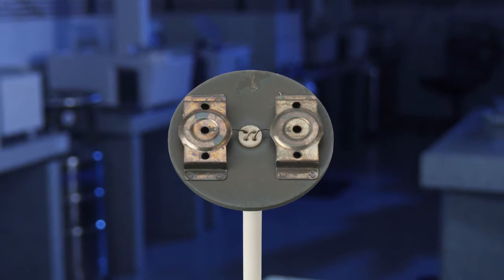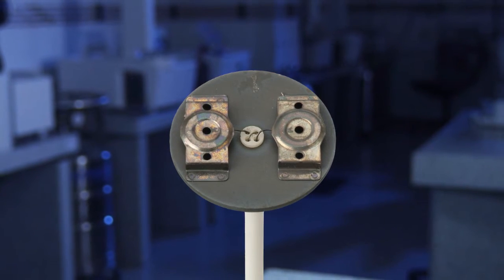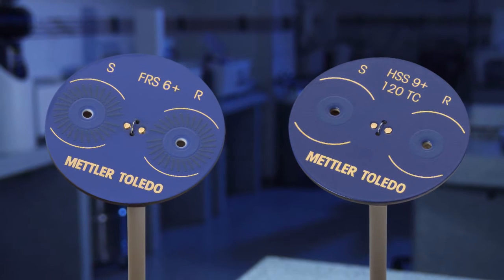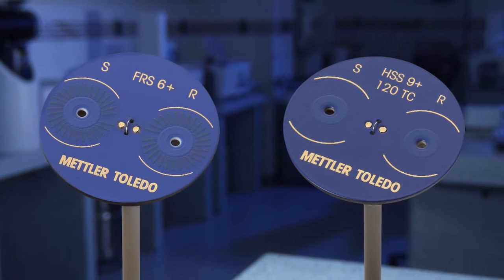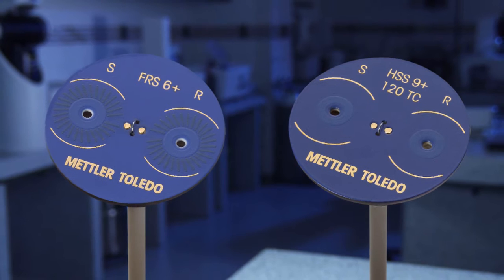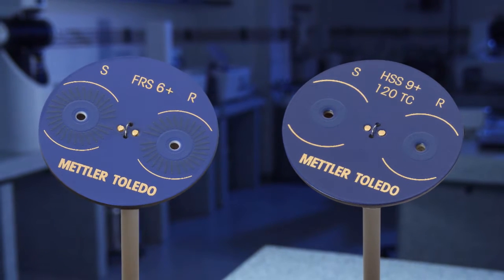The robust metal sensors in the early 90s evolved to the fast response, high sensitivity and robust multi-layer ceramic sensors with up to 120 thermocouples used in today's instruments.